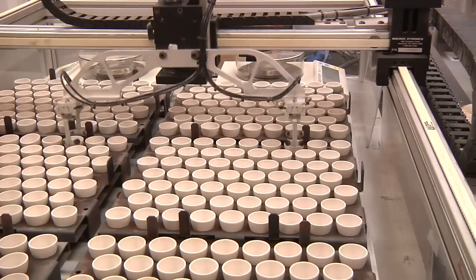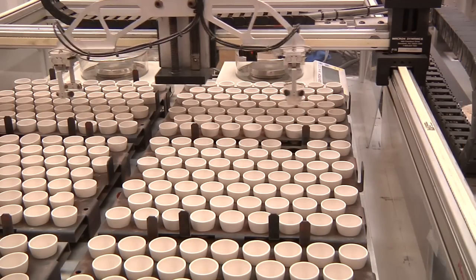And we analyze organic matter by organic matter robot, weighing loss on ignition.